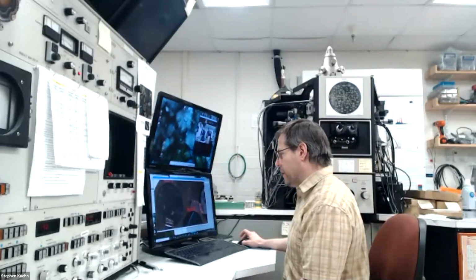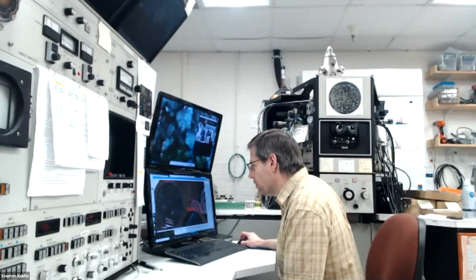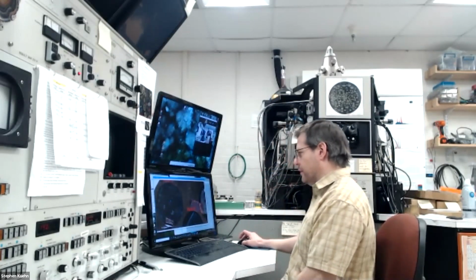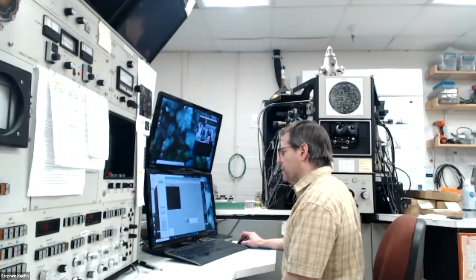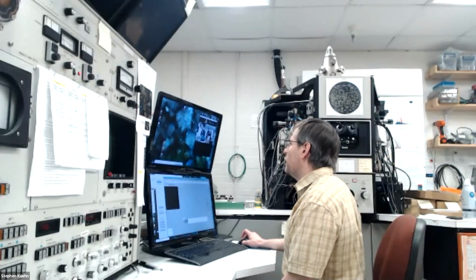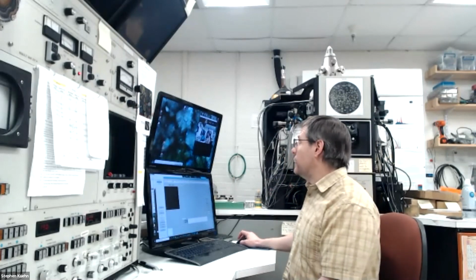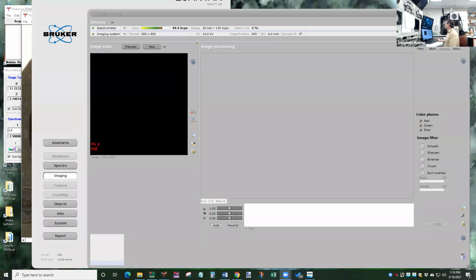So here's our picture. Let's see, I'm going to look on here. It's a little bit dark. Let's see, there's a big crystal. Well, one of these big crystals. I think this might be one of the white ones. So I'm going to double click on one of the white ones. What I think is one of the white ones anyway. All right, so then I'm going to go to the other software, and share screen back on. Okay, now it should be showing.